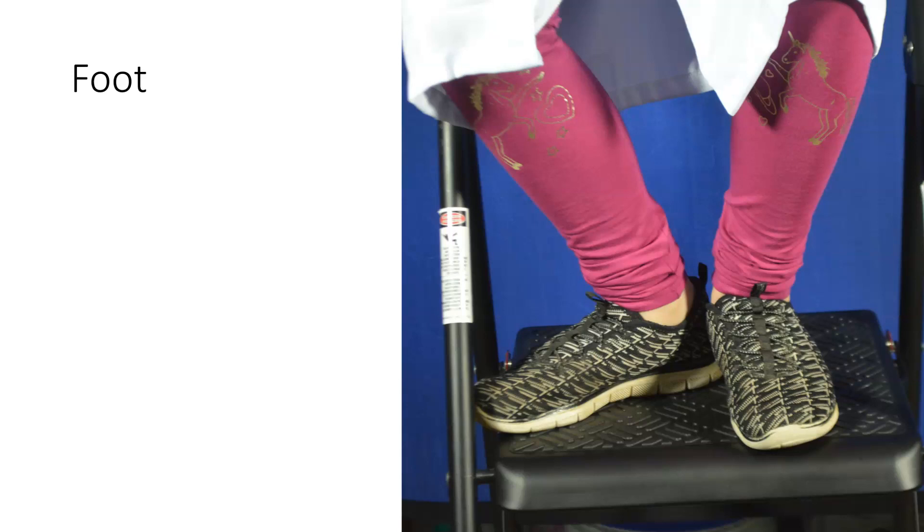So when we look at personal protective equipment, we are dealing with things that you use that protect you from other things on the outside. When you look at the mask that you put over your mouth, that basically gives protection both ways. It keeps the individual who is on the outside protected from what you've got, and it also protects you. So personal protective equipment, very important part in microbiology.